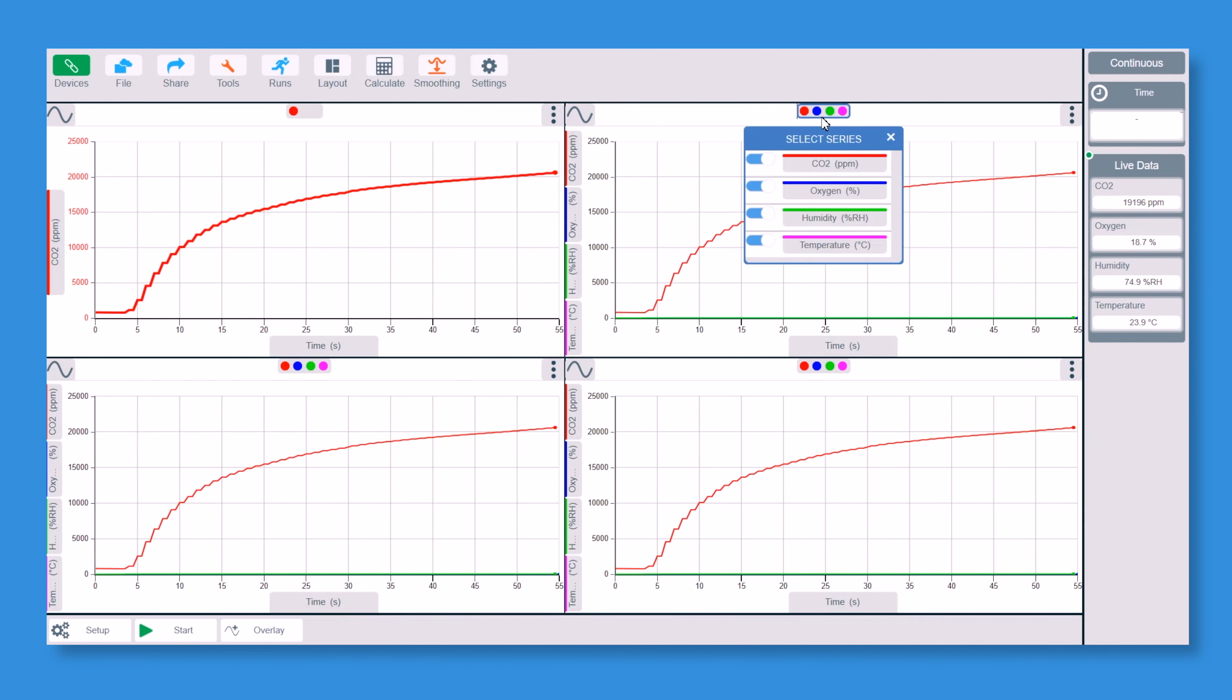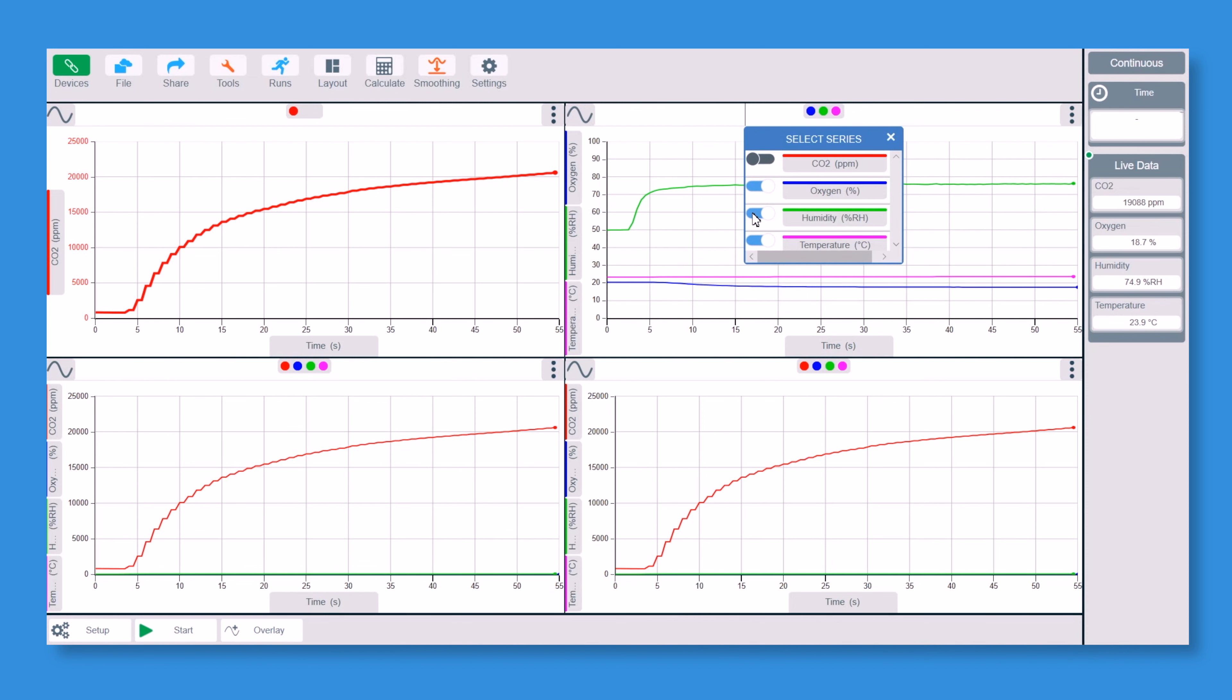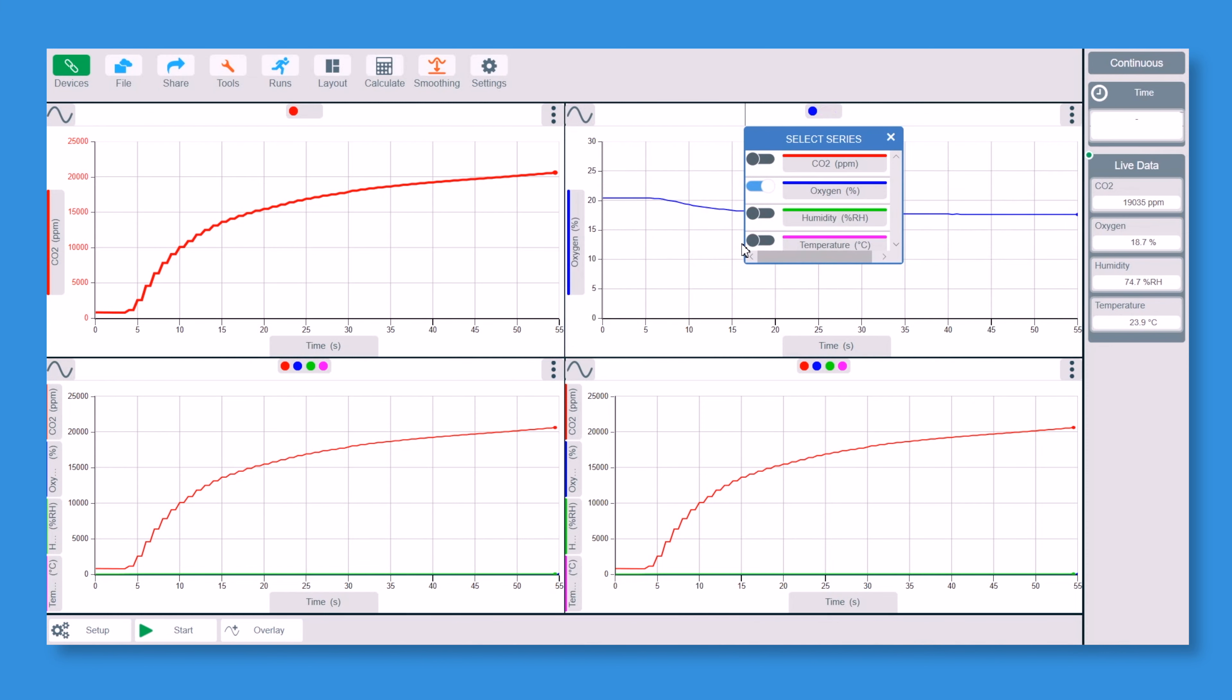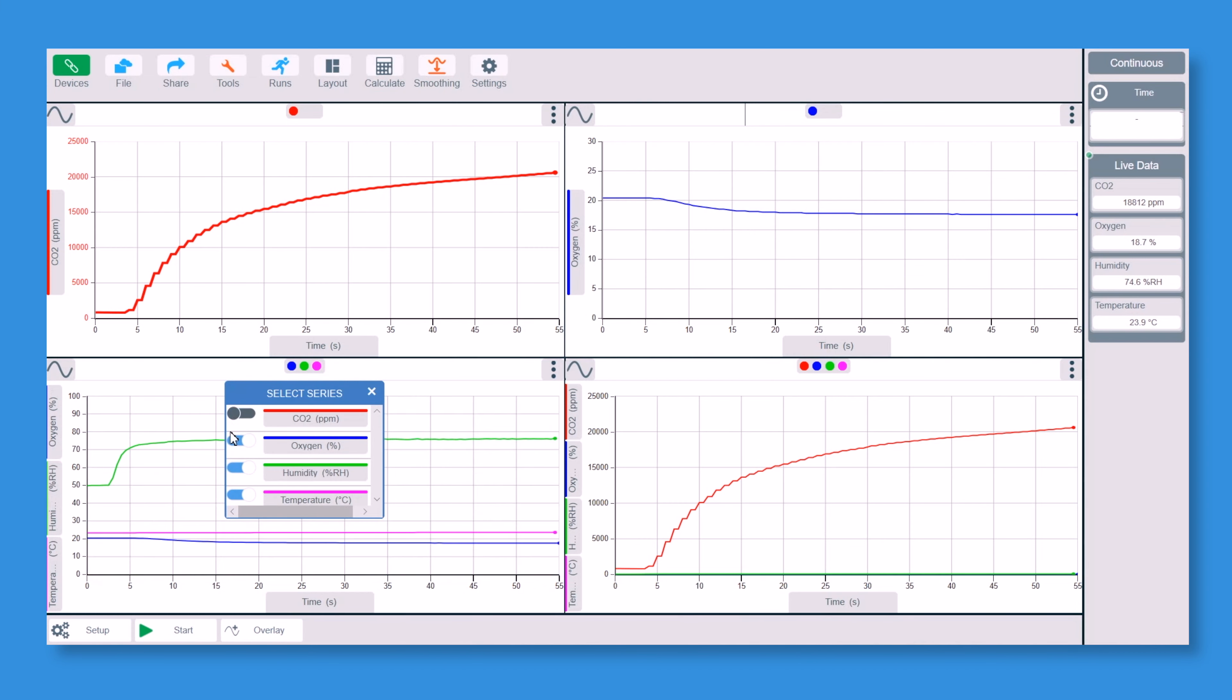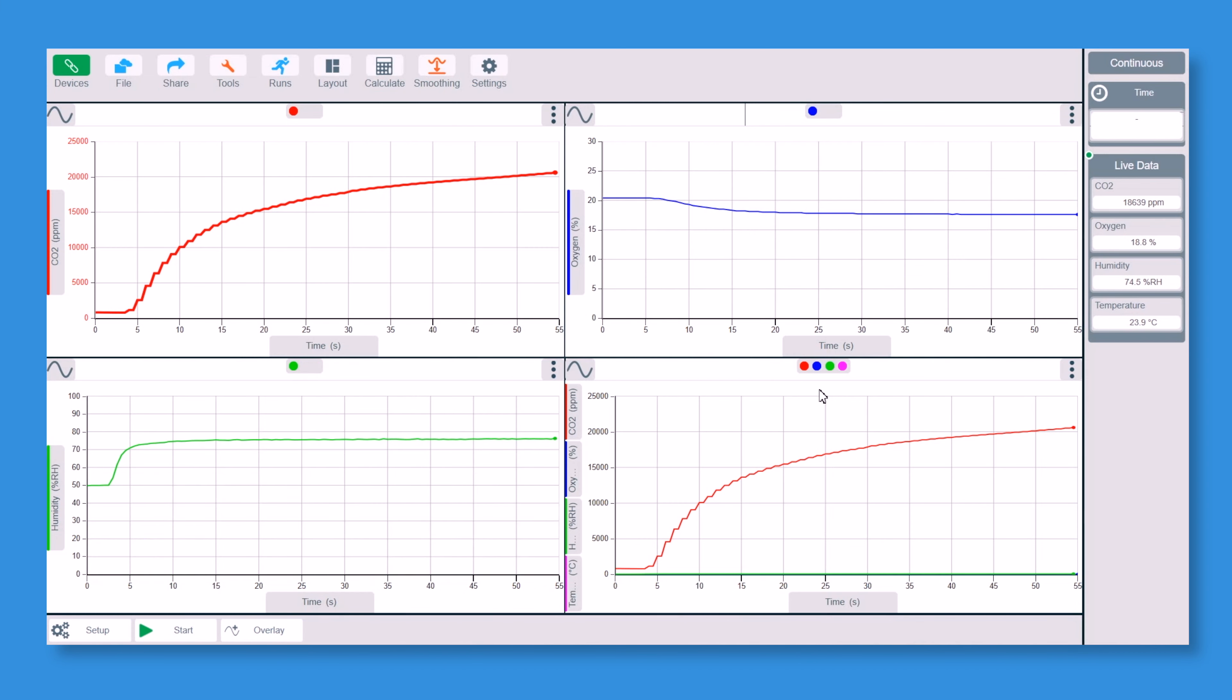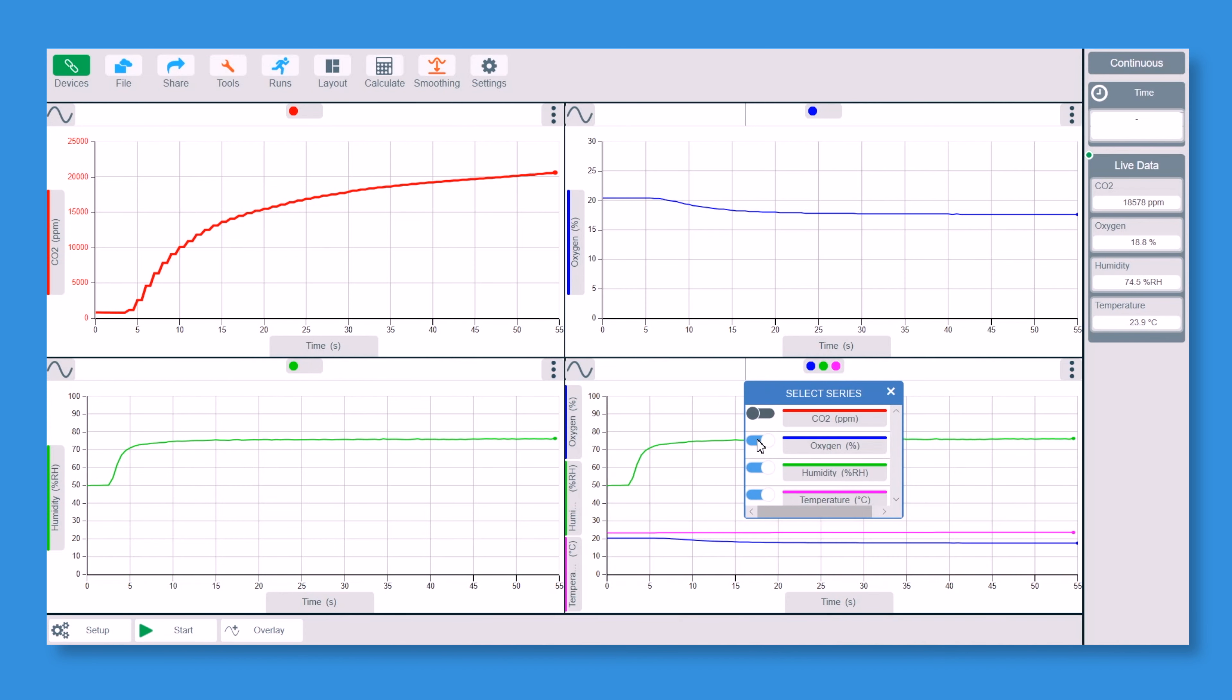But at the moment I'm going to turn off CO2, humidity and temperature on that one. This one I'm going to turn off CO2, oxygen and temperature and this one, turn them all off apart from the temperature.